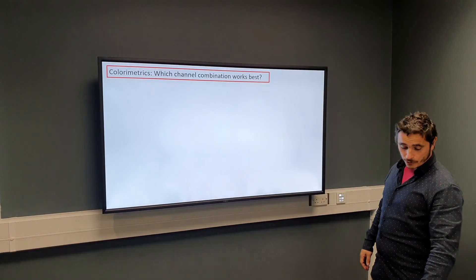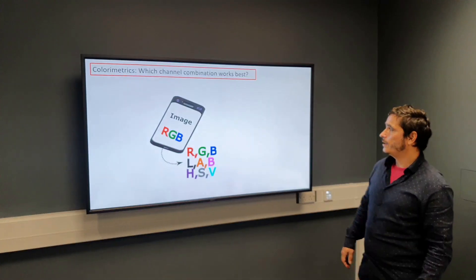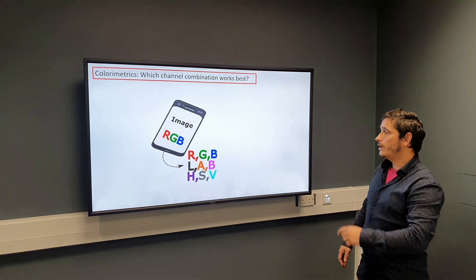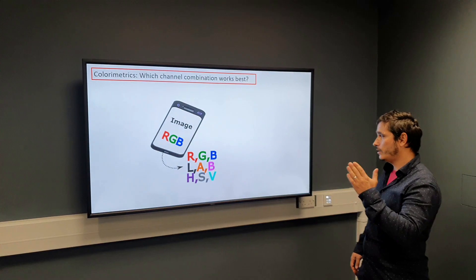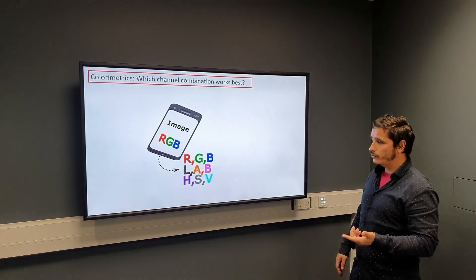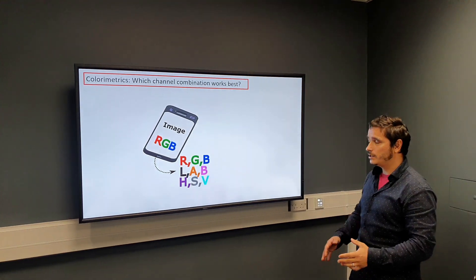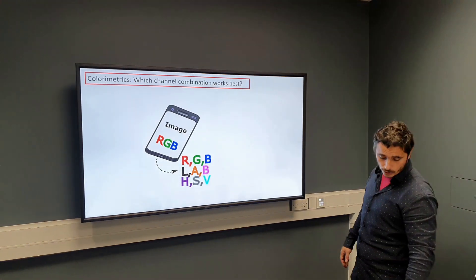The system for colorimetric detection is basically based on taking an image with the smartphone camera, which is then registered in red, green, and blue — or RGB — values. With the app that was developed, we can separate those into different channels: the red channel, the green channel, and the blue channel. We can also mathematically convert them to other channels such as L, A, and B, or H, S, and V from different color spaces, all of which have separate properties that can be used to optimize color quantification.